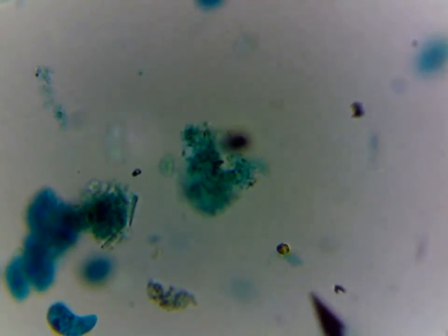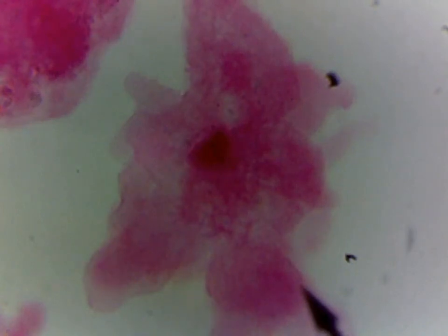And then I'm going to actually go to a different slide so I can show you a better picture of one. So this one happens to be stained in pink. It's a little bit easier to see and not quite so cluttered. So we're going to take that up to high power, and we'll take a look at one of those individual amoebas. And again, you're going to want to pause the video once I get it focused here, draw it, and then identify and label your structures.